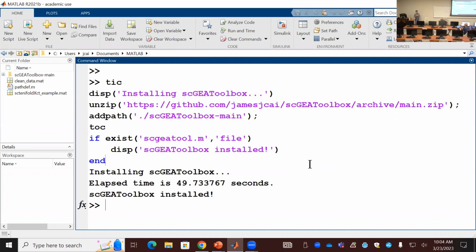So if you have the problem, say, I use UMAP and get this, and t-SNE and get that, which one is the best? Now you can put them together and use the resolution provided by multiple different embedding algorithms. We can see how good the outcome is when you use real data analysis on your data, and decide whether I will put this as a default option in the package. I still have to wait until we have some practical experience with this method.